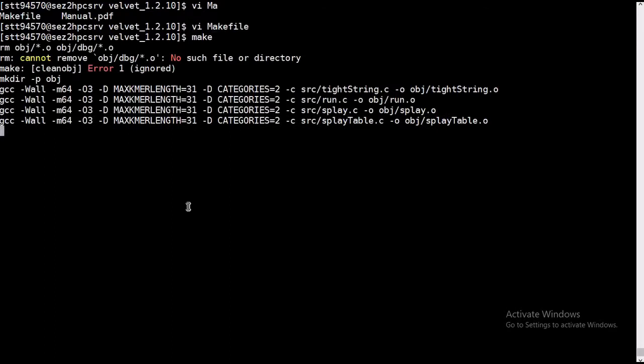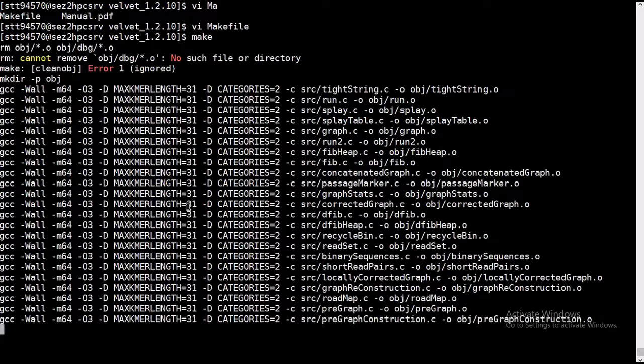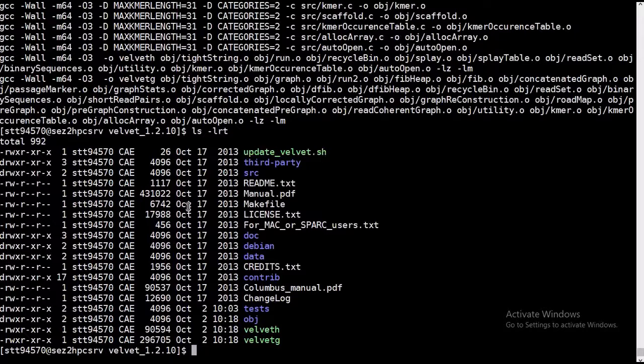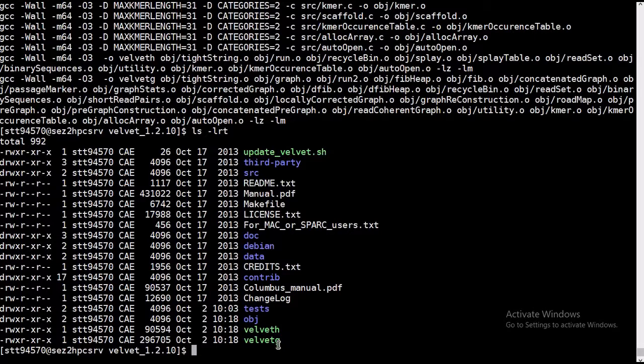Type make, it started making. It's done. You can see two files have been created here, and I have installed this velvet.